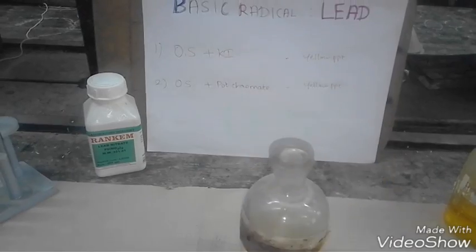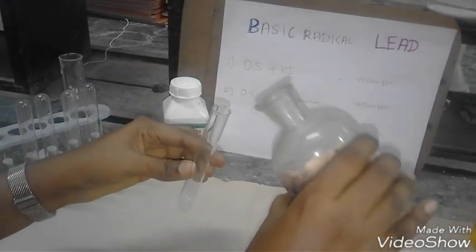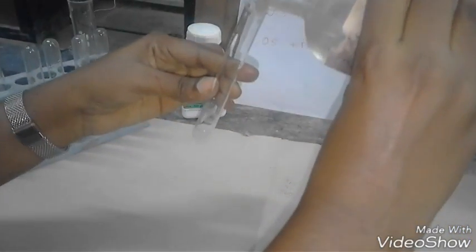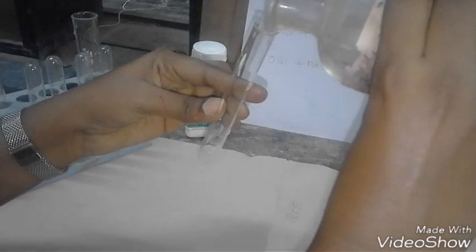First test is adding potassium iodide to a small amount of original solution. I kept it in the test tube. Add potassium iodide solution drop by drop, not more than the original solution.